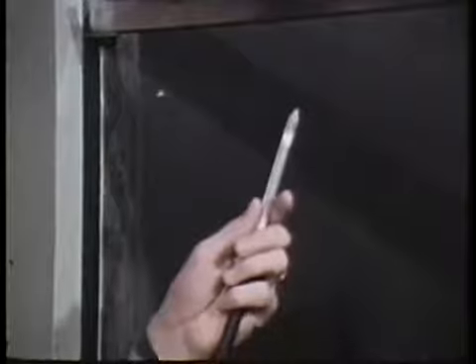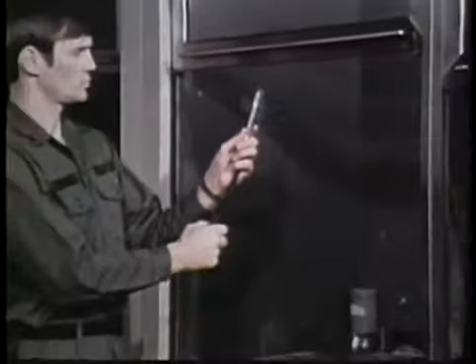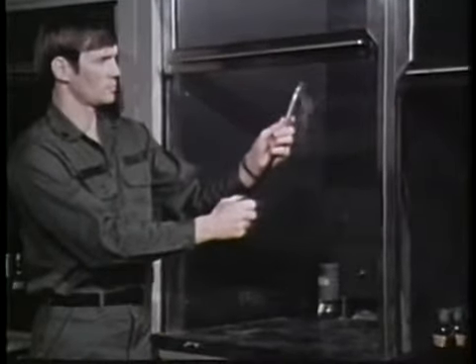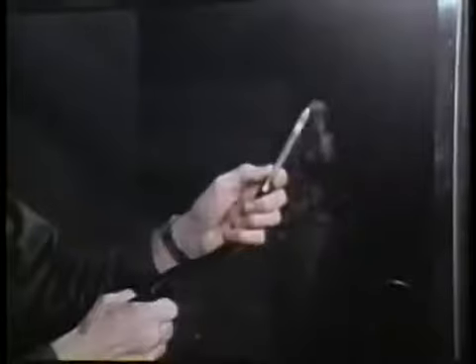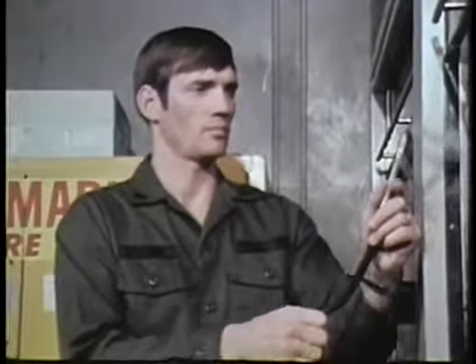Another important check of the lab hoods is done with ventilation smoke tubes. They show whether the hood is exhausting the air properly, or whether there is some blowback into the room. When using these smoke tubes, be careful not to inhale any of the smoke or get any on your clothes.